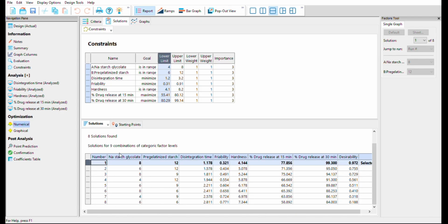Okay, so in this manner, you can easily undergo the optimization. So this is the overall approach for dosage form formulation, and by utilizing these statistical parameters and the Design Expert software, we prepare a formulation in this way. And in many articles you will see this approach of Design Expert.